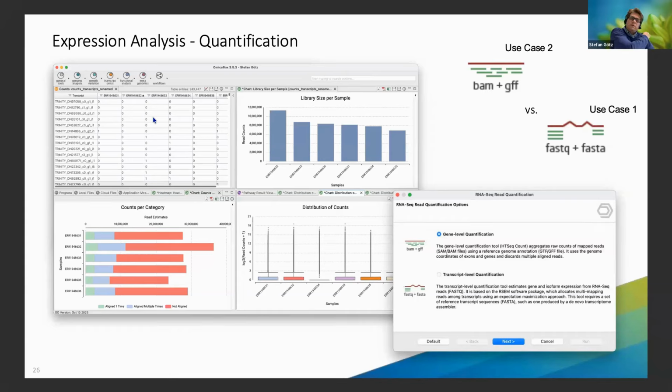And if you have all this covered already, that happens to quite a few people. They say, oh no, all this is already set up with our own pipelines or our other tools, or we get it from our sequencing facility. That's fine. You can just take your count table and go into OmicsBox and then start your functional analysis from there. Okay. We do recommend to repeat the differential expression or the time course analysis, because we need raw counts for a lot of different visualizations later on. I will remind you about this in a second.